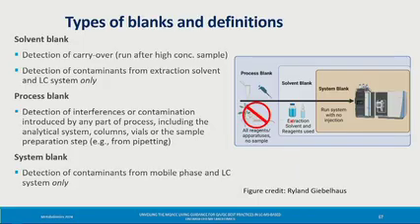And again, just to differentiate these a little bit, this kind of solvent blank or reagent blank would be just the solvent on its own, or just a reagent diluted and run on its own, not like water carried through the entire sample prep procedure.